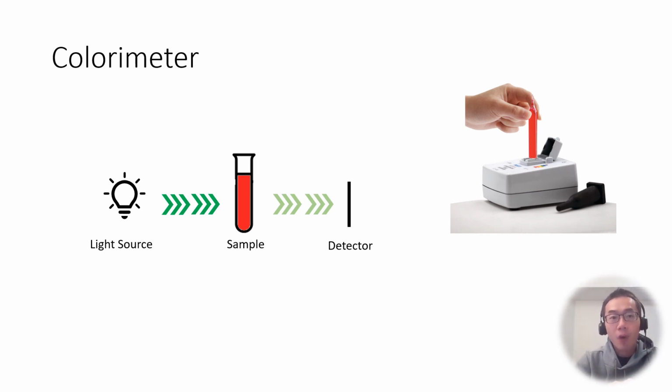So far, we have only been making qualitative observations using our sight. One of the disadvantages of qualitative observations is that they might be subjective. What appears to be very intense red for you might appear to be something completely different for another person. That's why it is always a good idea to include numeric measurements, or quantitative measurements, whenever possible.